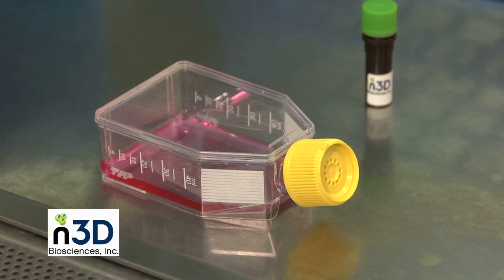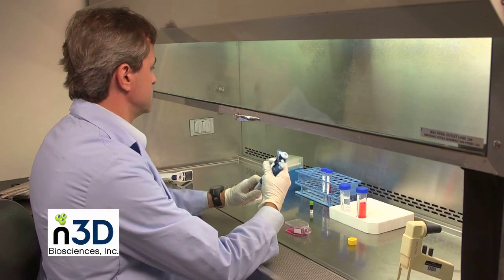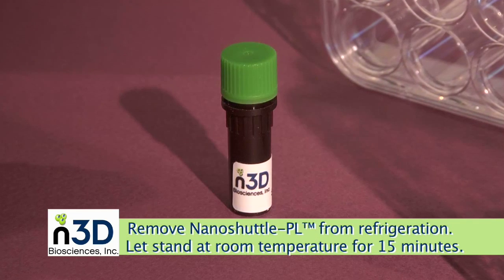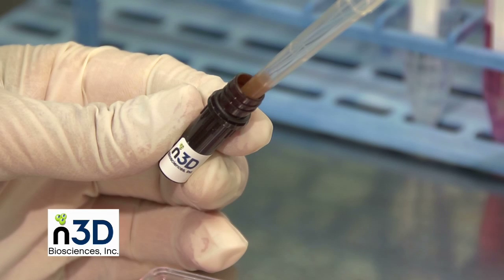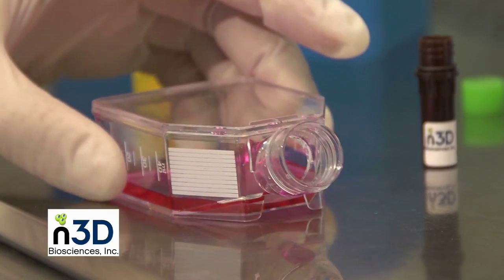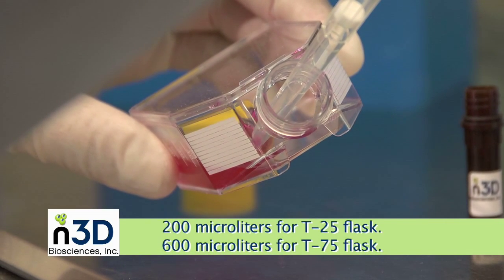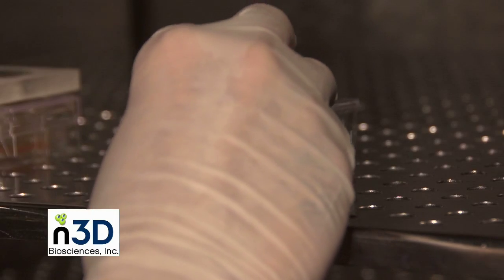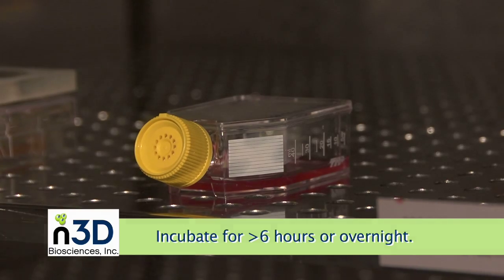Start with a flask of your cell type in whatever media you typically use and culture the cells to close to confluence following your standard culturing protocols. We first treat the cells with NanoShuttle PL reagent to introduce a small amount of biocompatible magnetic nanoparticles to the cells. Homogenize NanoShuttle PL in its vial by pipetting it up and down at least 10 times. Add NanoShuttle PL and gently agitate the flask to evenly distribute. Place treated cells into the incubator for at least 6 hours or overnight using your lab's standard cell culture incubation conditions.